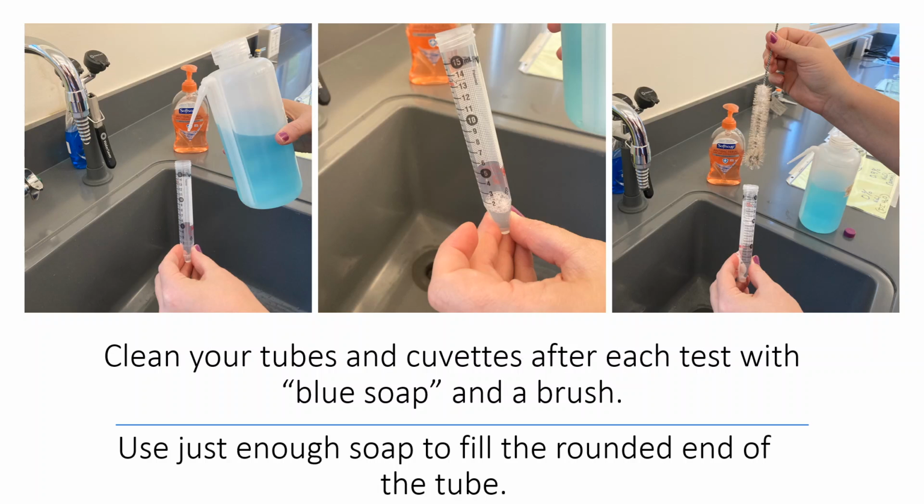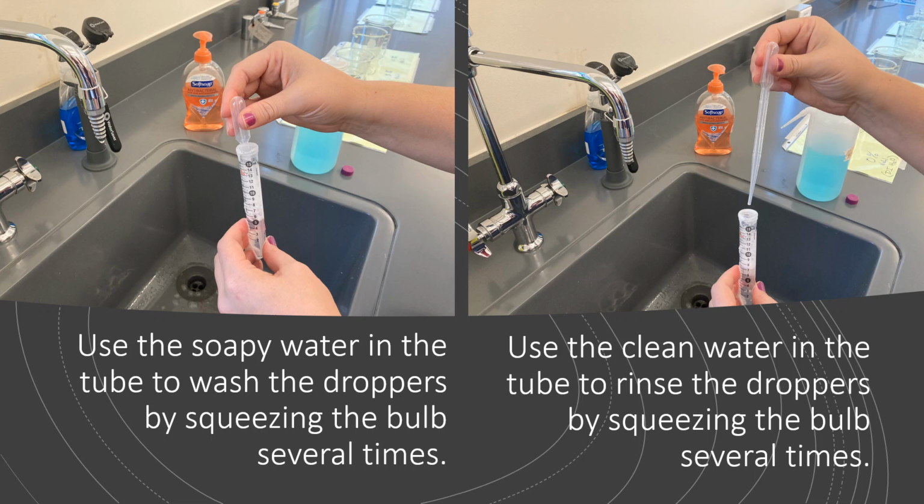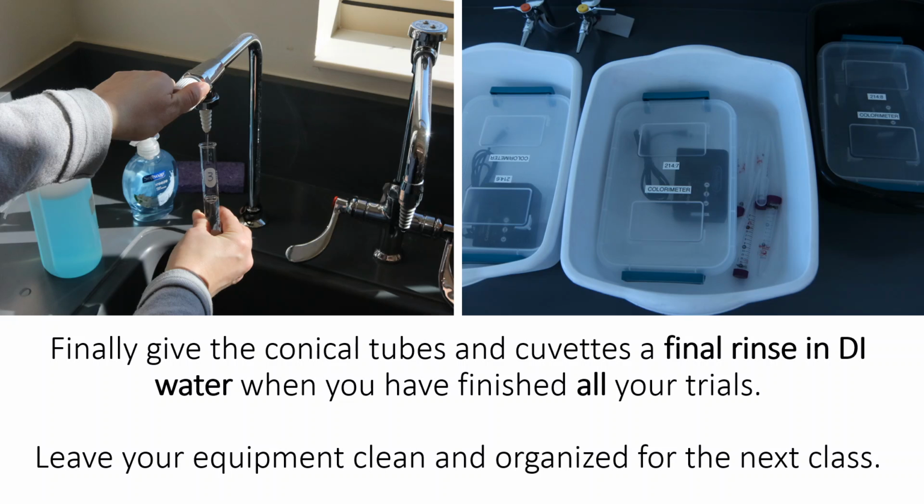And then this is more relevant instructions for the people in a lab of how to properly clean up all of the test tubes and make sure we return the lab back to the way we found it at the beginning of class.